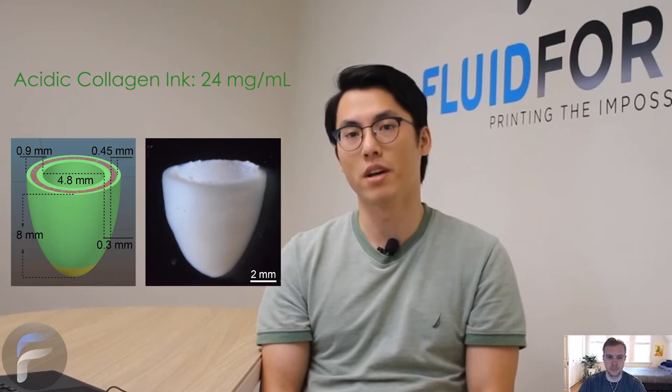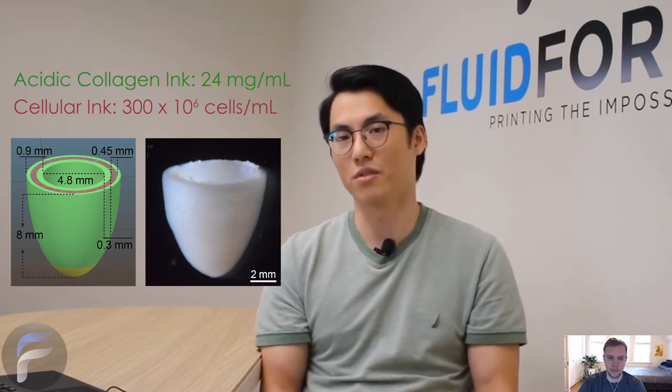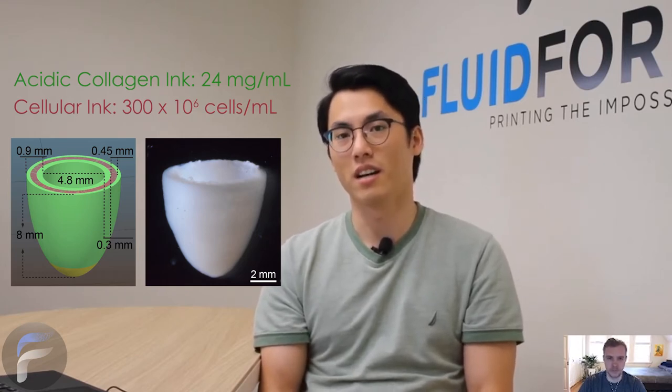In terms of the concentrations of each of these inks, they were much higher than what you might encounter in a lot of tissue engineering studies. For the collagen ink, we were printing at 24 mg per ml, and for the cells, we were printing at around 300 million cells per ml, which is ridiculously high. But we thought that was necessary to recreate that highly dense, highly concentrated environment that cells are in inside our body.